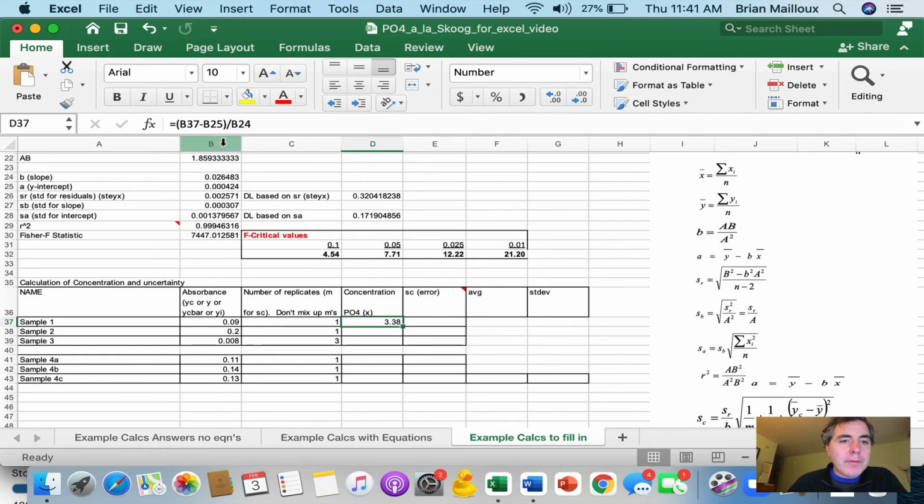Now let's put our dollar signs in. So we're going to want to put dollar signs here. And so you can imagine, look, we have these 6 samples. Let's figure them all out. So 0.2, that'll be 7.54. 0.008, oh, that's low. 0.29. 4A, that's sample 4, 0.11, 4. Right, then we have these 3 triplicates. So that's fantastic. We have our absorbance, we calculate our concentration.